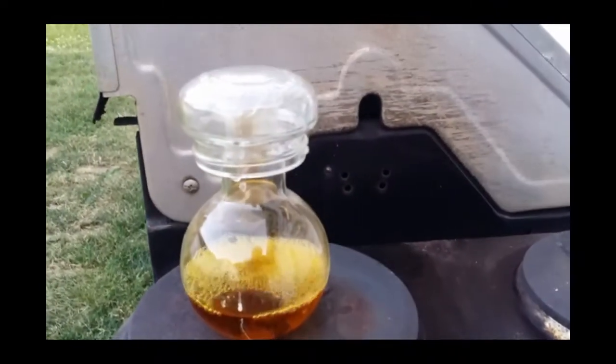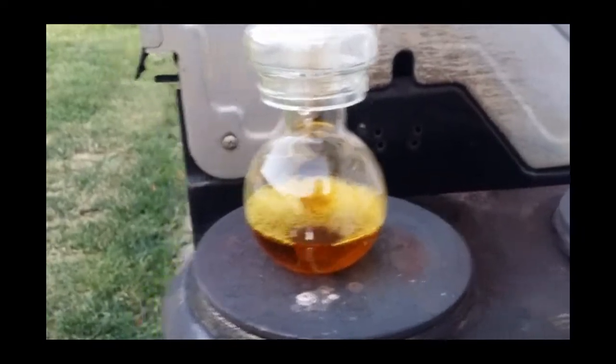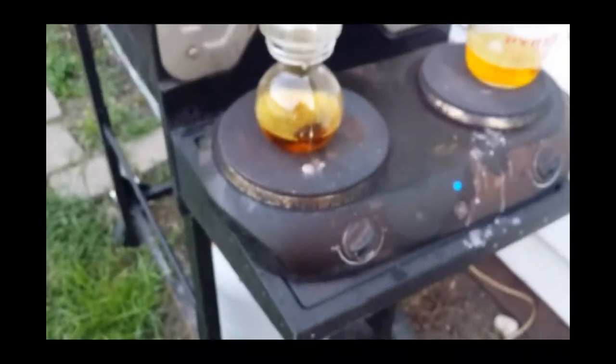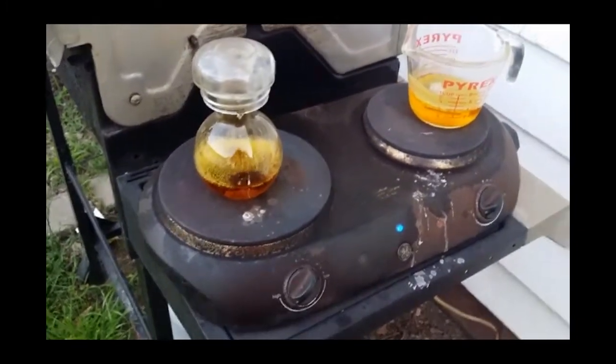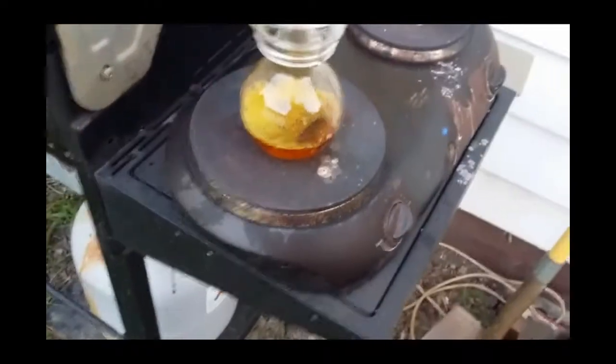I'm dissolving a gold tooth inside of this round bottom boiling flask, which is flattened on the bottom. I do have a mantle for it, but the mantle is a little bit too large, and it takes a while for the heat to transfer, and this hot plate doesn't get very hot, so let's see where my heat setting is.